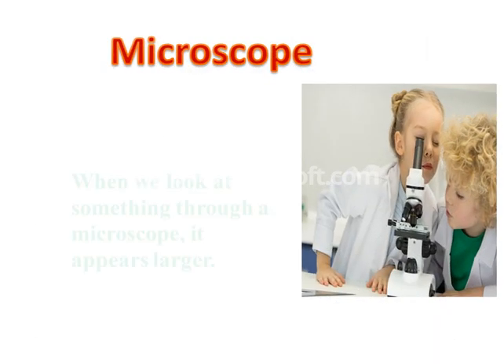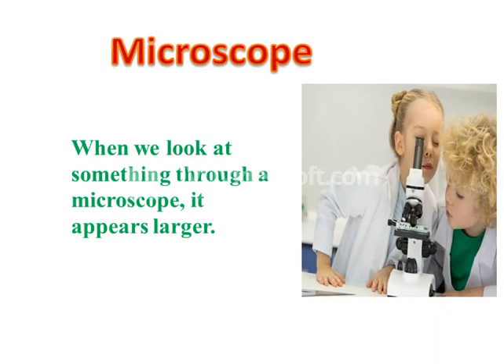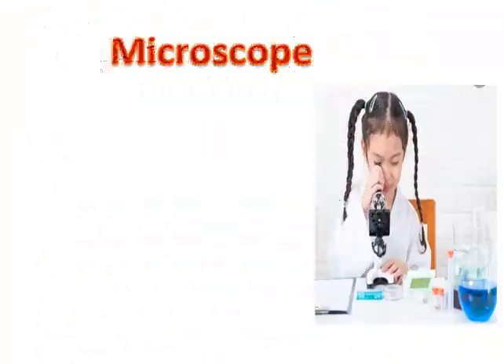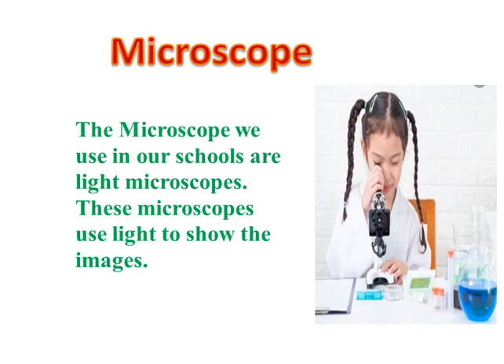Microscope. When we look at something through a microscope, it appears larger. The microscopes we use in our schools are light microscopes. These microscopes use light to show the images.